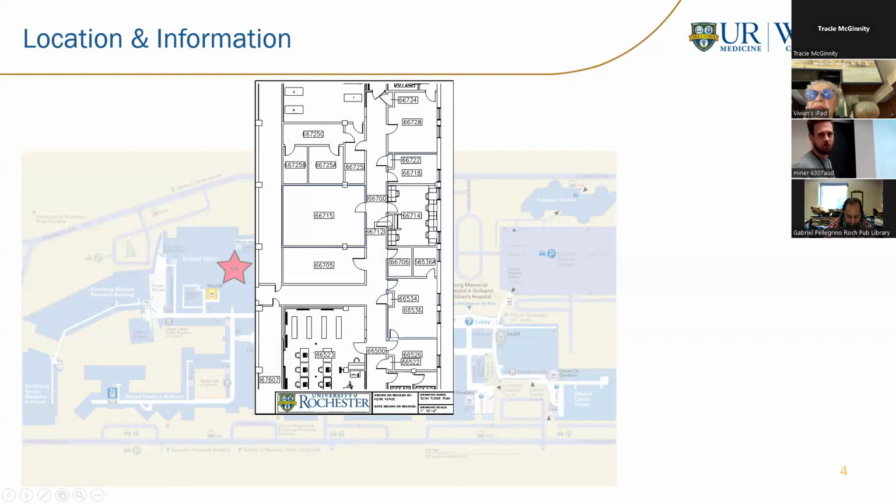And really, where we're set up to work, we have this staff room for our data management, for accruing clinical data to annotate our specimens, a really nice wet processing lab, and a really good sized storage facility for liquid nitrogen storage, -80 storage, and of course FFPE blocks, which I'll talk quite a bit about later. And then the satellite room off of our storage facility, that is where we're bringing in some of these advanced technologies. So in that room we want to build a spatial analysis center to an extent.